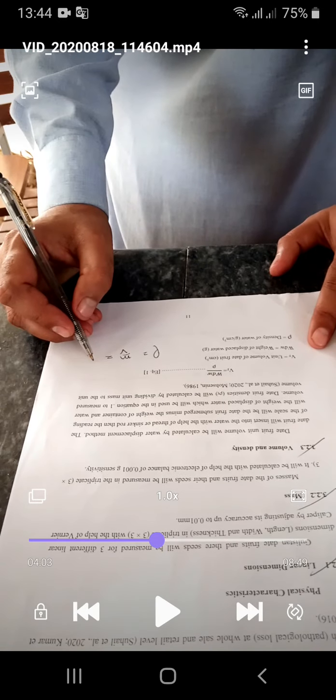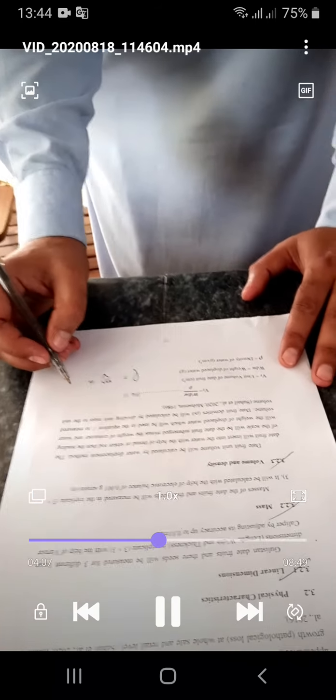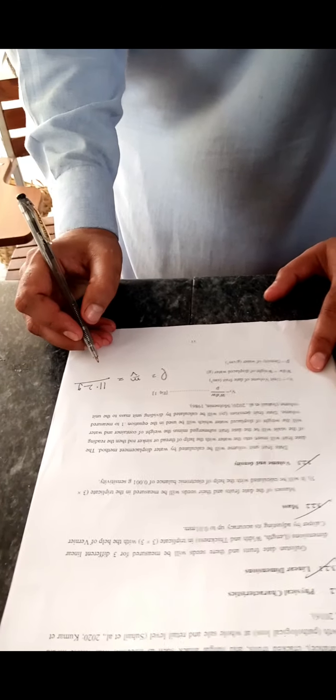Now we will find the true density. The formula for density is: rho is equal to mass per unit volume. The mass of the fruit is 11.2 grams. So the density will be equal to mass per unit volume, which gives us 0.94 grams per ml, or grams per centimeter cubed.